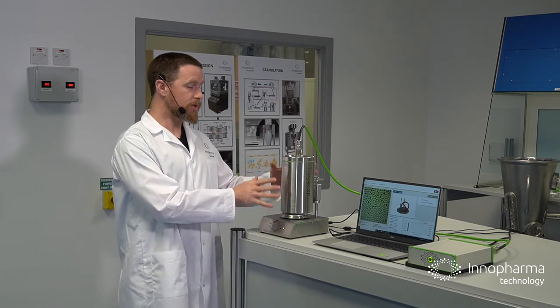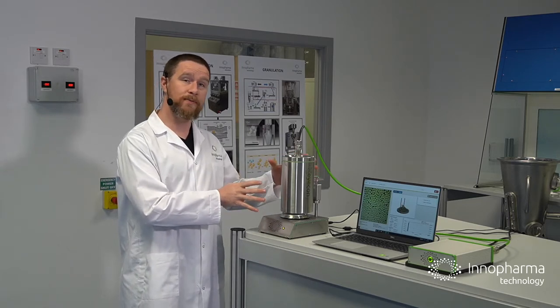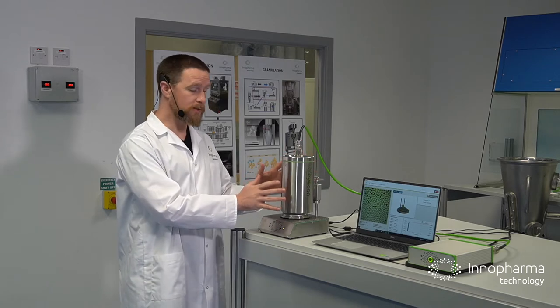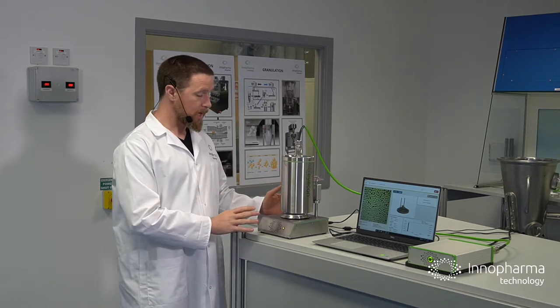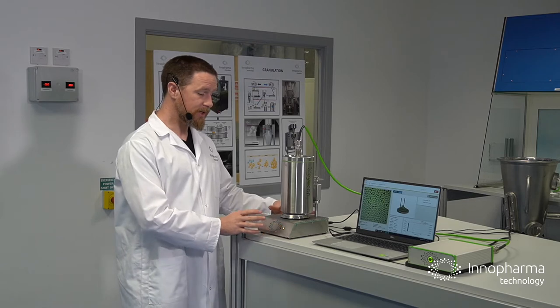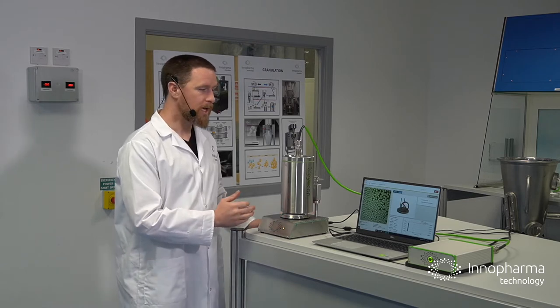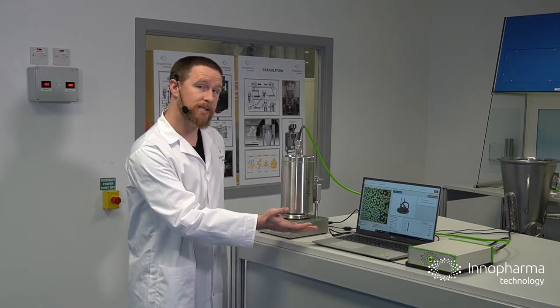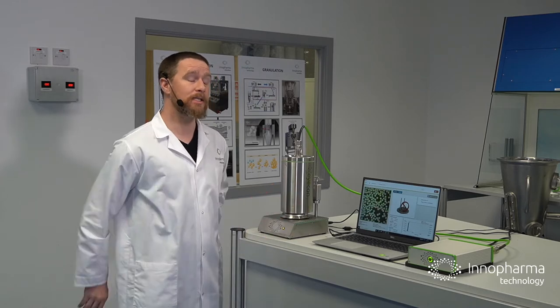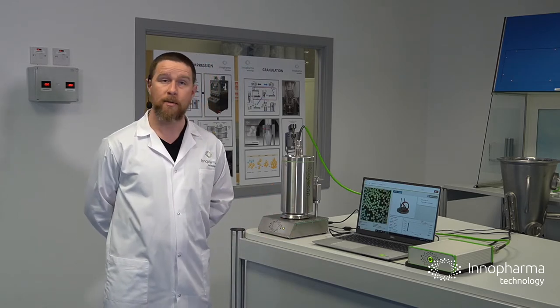Here we see the ICON2. It can measure between a size range of 50 to 5,500 microns for powders and bulk solids. Here we see the sample presentation stage that is moving the material underneath the camera, and over here we can see the iPass software which is automatically digitally recording the particle size results, but more on that in a moment.